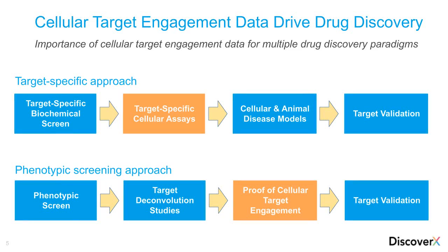So in most cases, the binding will allow it to increase the levels of target protein due to this possible stabilization effect. All right, so let's bring this into context to the drug discovery world. You're looking at different approaches here in the drug discovery continuum. And where would target engagement play a role?